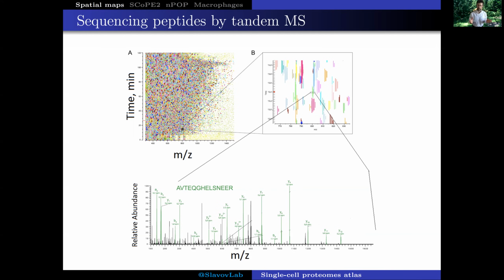And the key part of the simple description here is that while we can determine the mass over charge ratios of tens and hundreds of thousands of ions in a single run corresponding to peptides, this information alone is not sufficient to determine peptide sequences. We have to detect enough peptide fragments from each peptide to determine its sequence, which is this information here at the bottom panel. And some of these peptide fragments are produced very inefficiently, which becomes a substantial problem for single-cell protein analysis or any other kind of analyzing minute amounts of proteins.